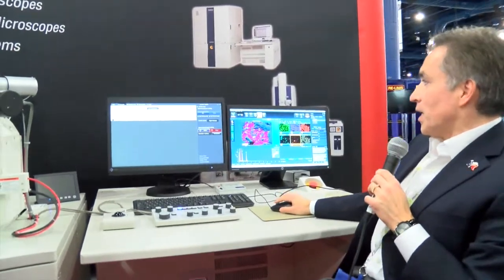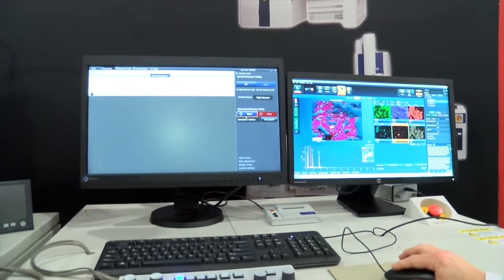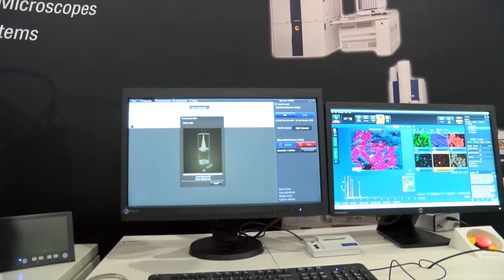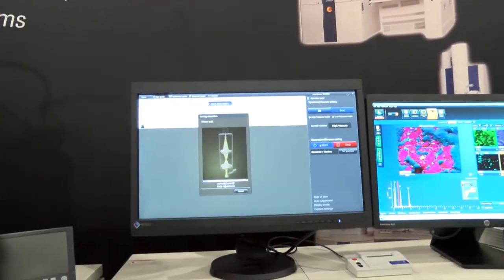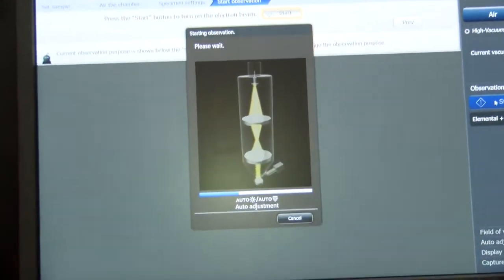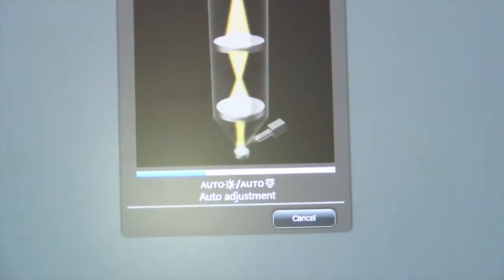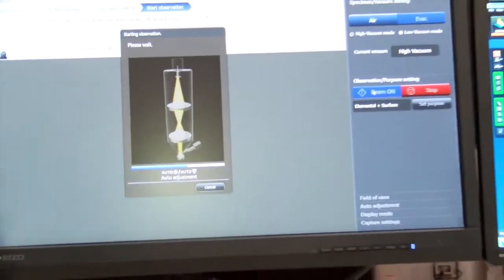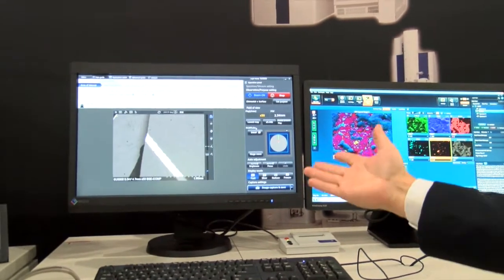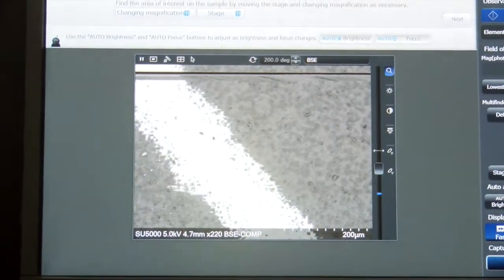Here in the GUI, when I switch over to standard mode of operation, I no longer have the full control of an advanced operator — all I can do right now is click the start button. As you can tell in the graphic, the software is even telling the operator what is happening to the machine: the beam is coming down, being focused by lenses, striking the sample, generating electrons, those electrons being collected by a detector — all the while realigning and recalibrating itself. In just a few seconds, it presents the user with a purpose-specific image that has been selected.